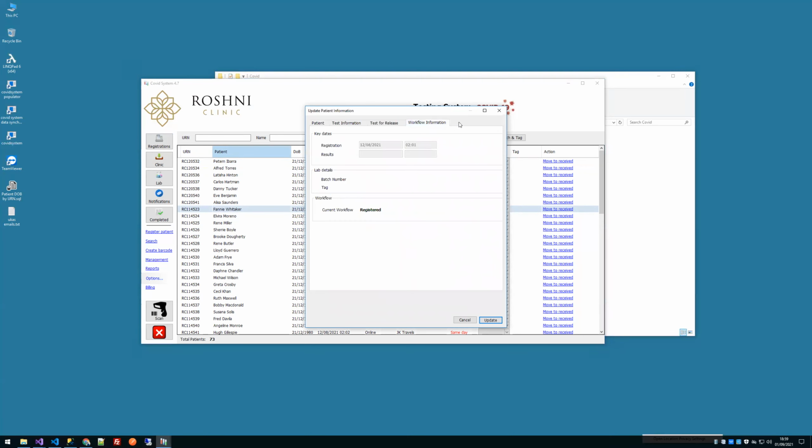I thought I had it in here. I thought it was coming. Audit trail. So here you should be able to see what it went through. I think in an earlier version I did have a nice diagram. I showed you what was going on when it was registered, when it was received, and so on, also with information as to who did what, online or in clinic, through the website, and so on.